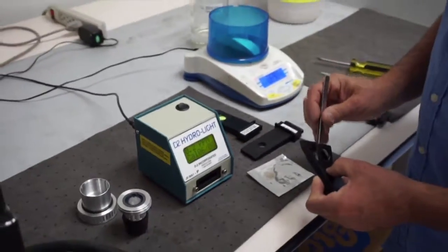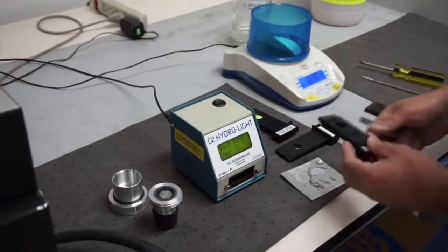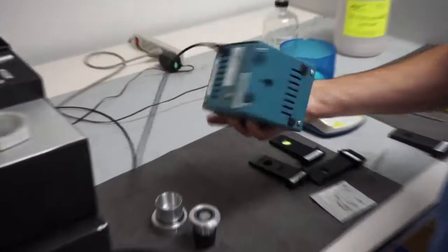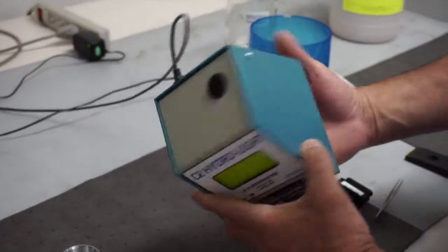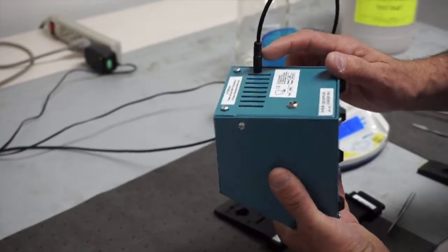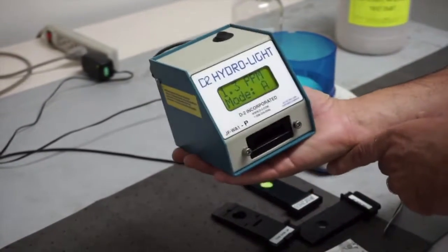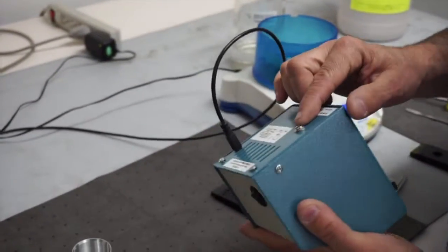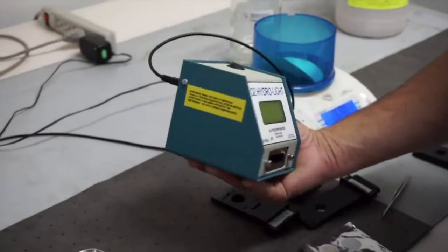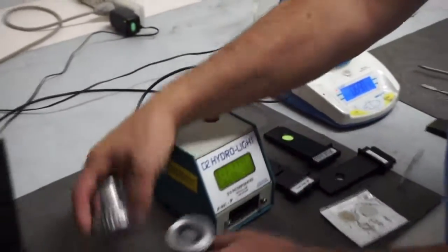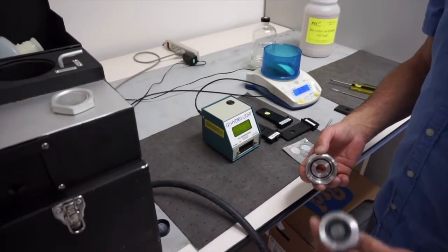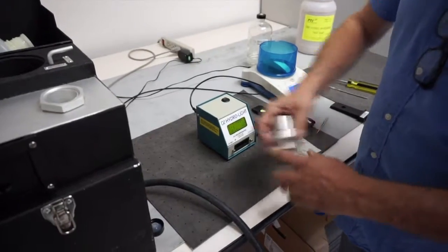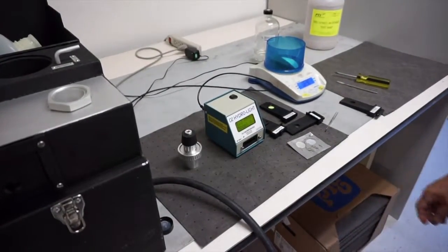So that's the new particulate measure instrument. You can see it's housed in the same box. Basically you can upgrade your HydroLite unit to this, and we have our USB connector, which is also power. All the data is available through the USB port as needed, and we also have our standard wall adapter plug-in. It's a light unit and you have the standard sampling equipment for either the water or the particulate pad. And that's the new unit.